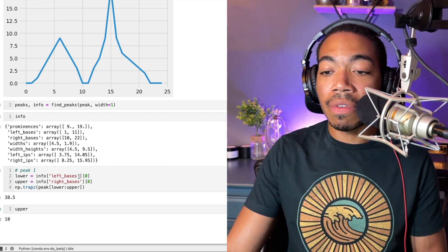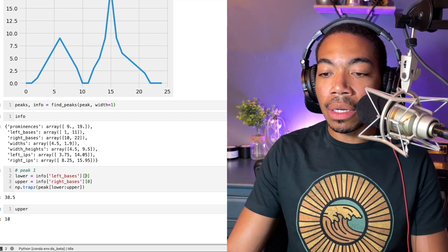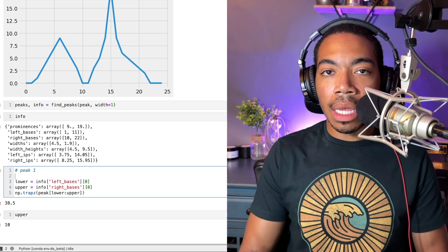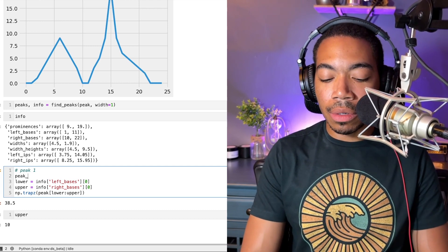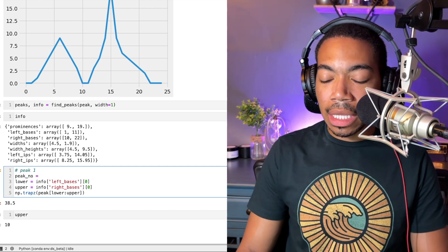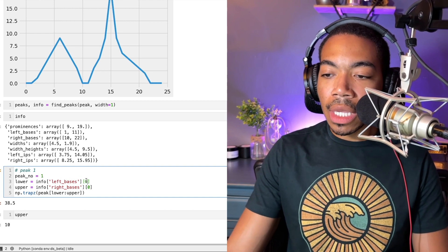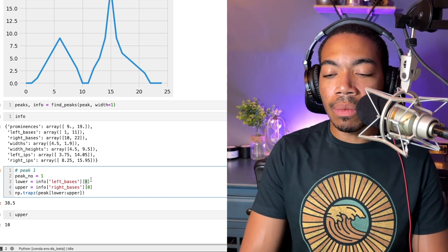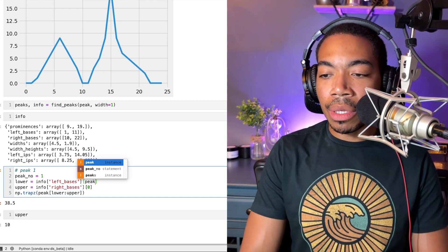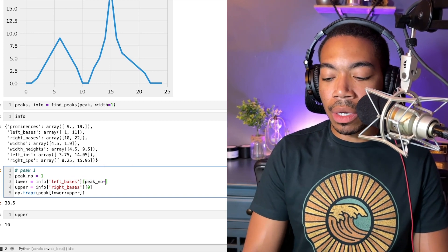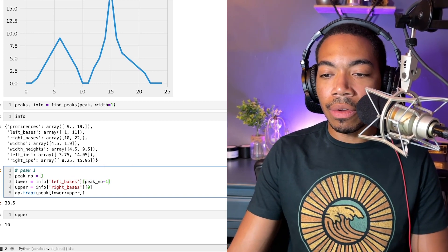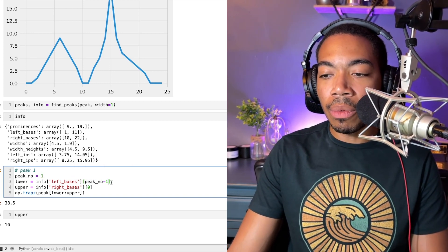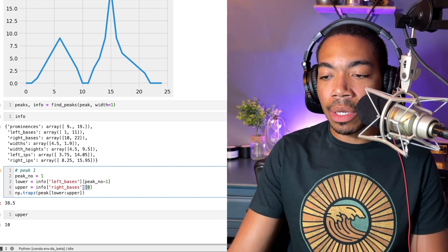Now let's make a variable called peak number. Let's set it equal to one, and since we know the index, how the indexing works in Python, we'll set peak number minus one. When we have a value with the first peak, we'll get zero; with the second peak, we'll get one.